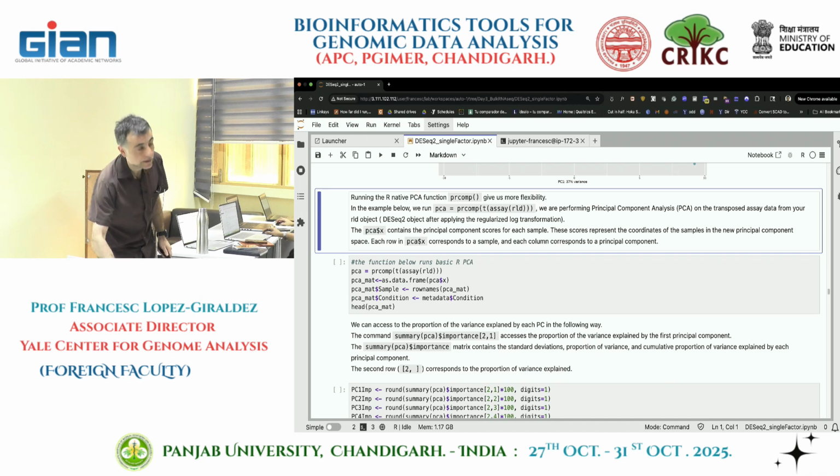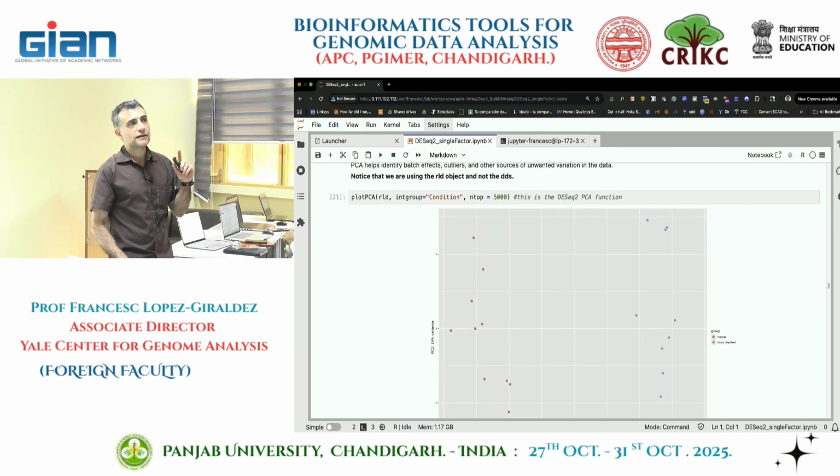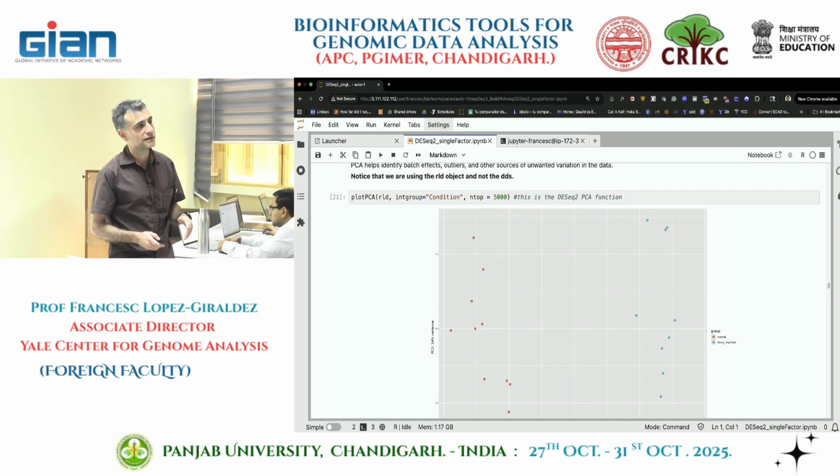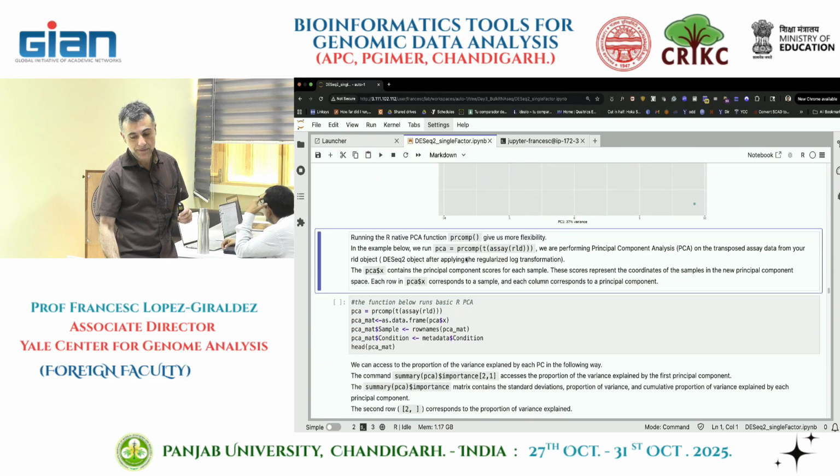If we change the condition, like we have changed it for the genotype, we get a PC plot, like a scatter plot. Right now we have done the comparison between the conditions. Again, here we are not doing any comparison. We are grouping the samples, or coloring the samples, based on the metadata. That's it. So we provide them exactly the same data.